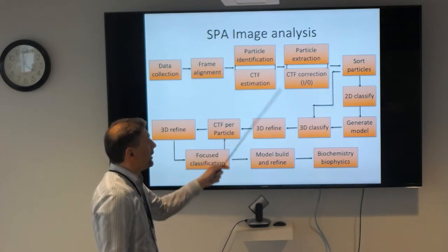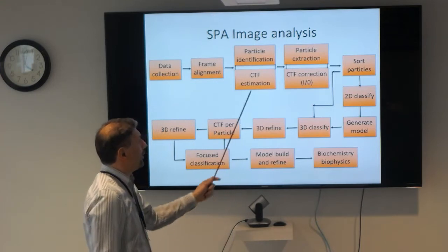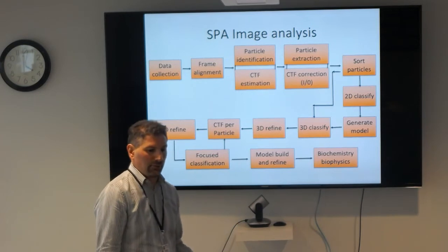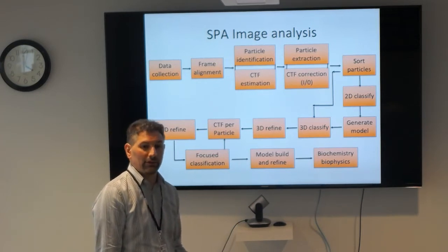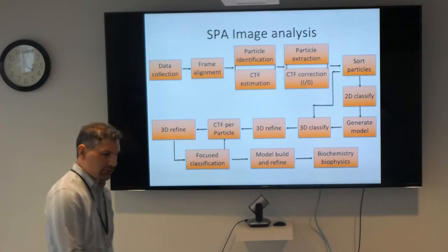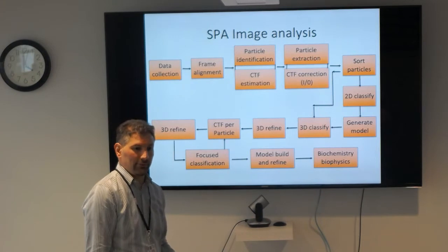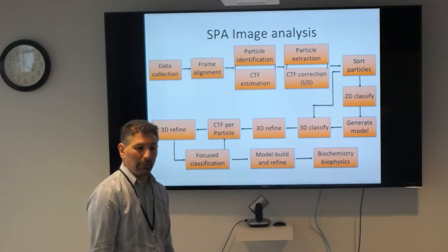But at this point, what you want to do is take all the micrographs where you have poor CTF estimations, meaning either you have wacky numbers for your defocus values, or low figures of merit or low correlation coefficients for the estimation of your defocus value. And you want to filter those out and take the best micrographs that you have. Okay, you can also look at your Thon rings, and you can see, okay, based on my Thon rings, is this worthwhile processing or not?